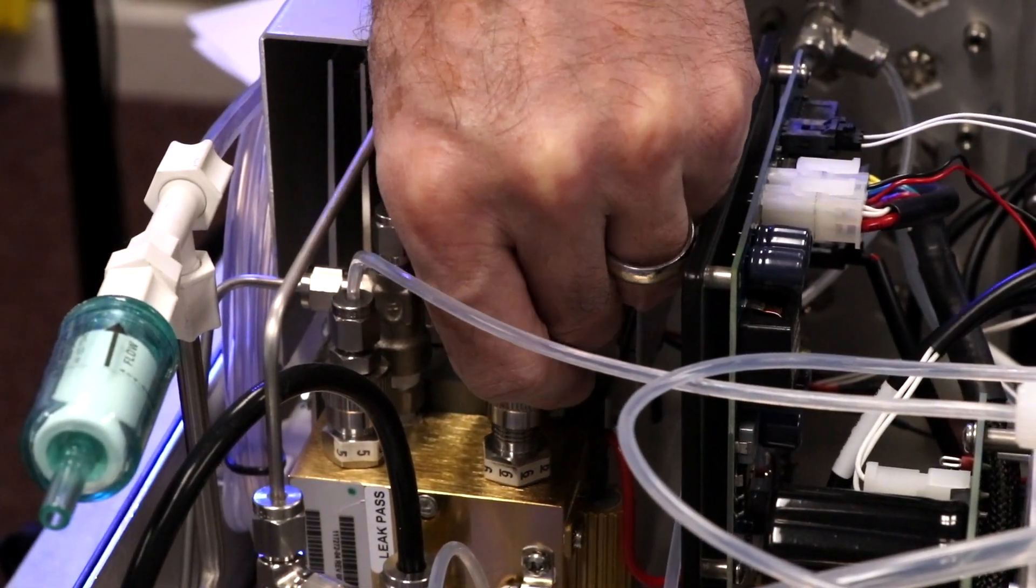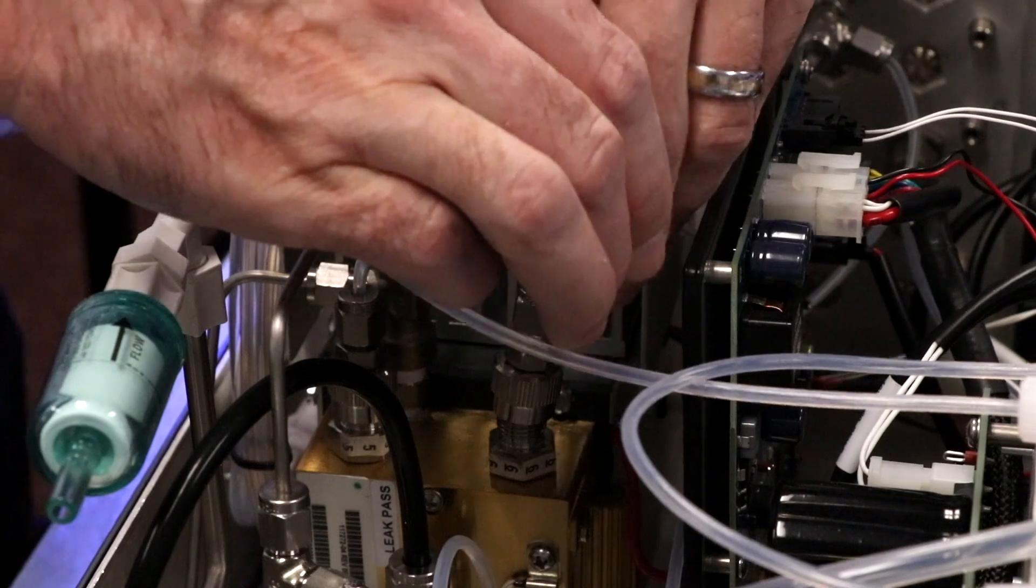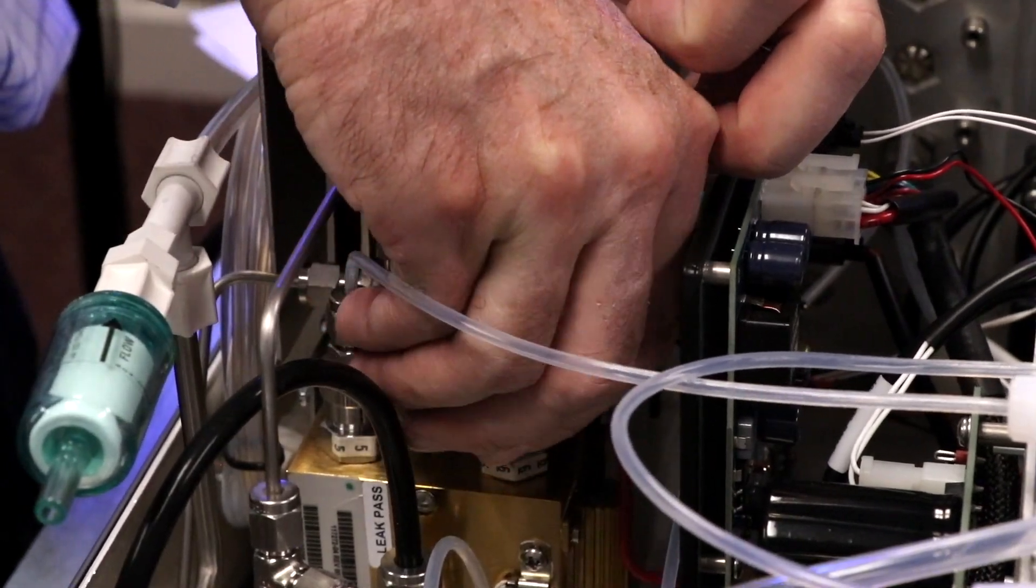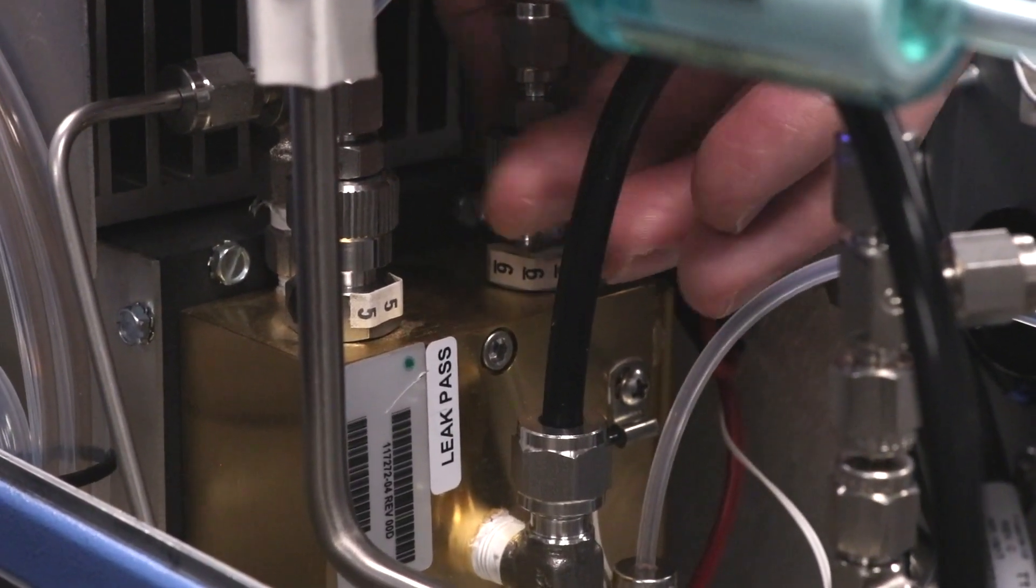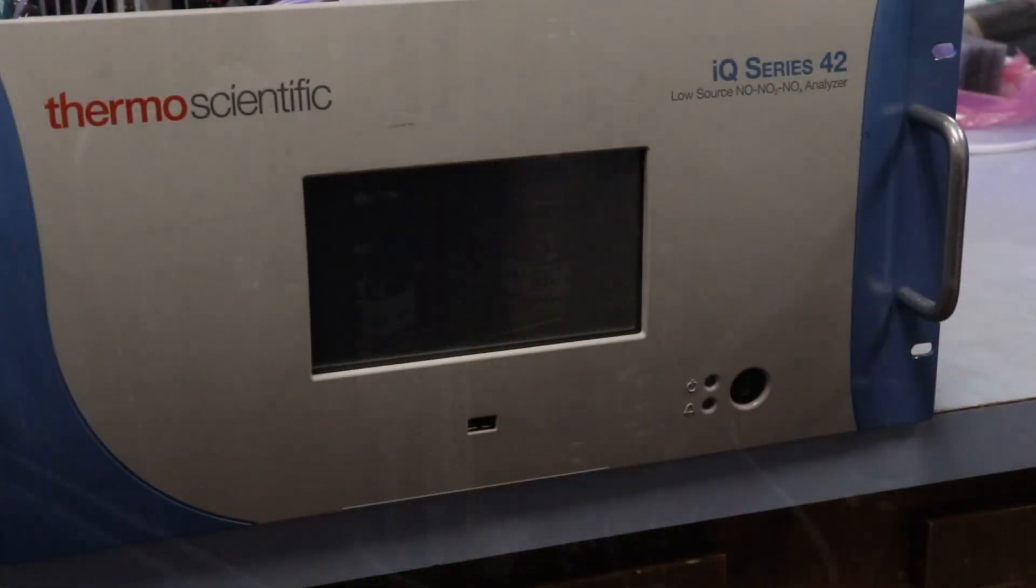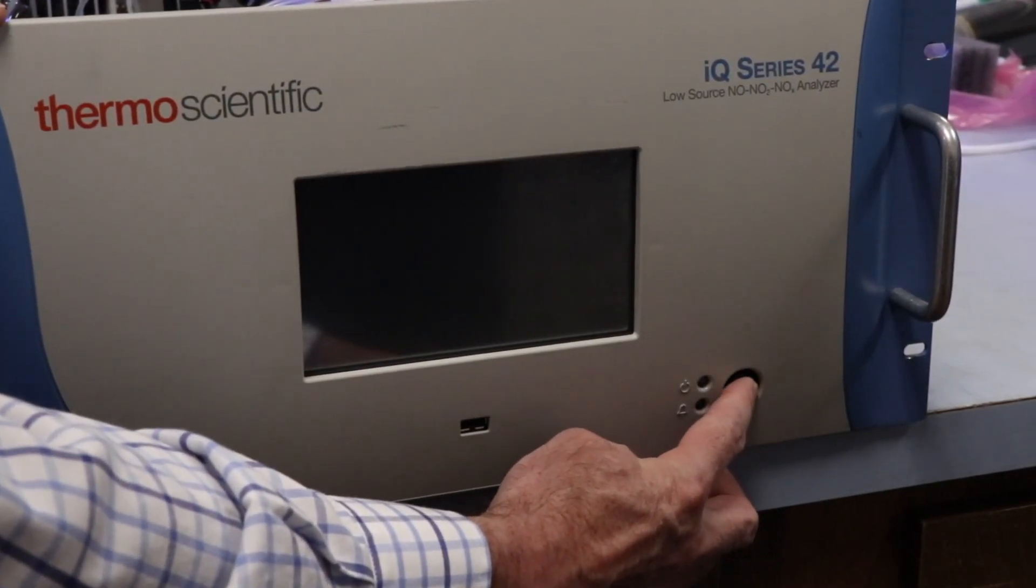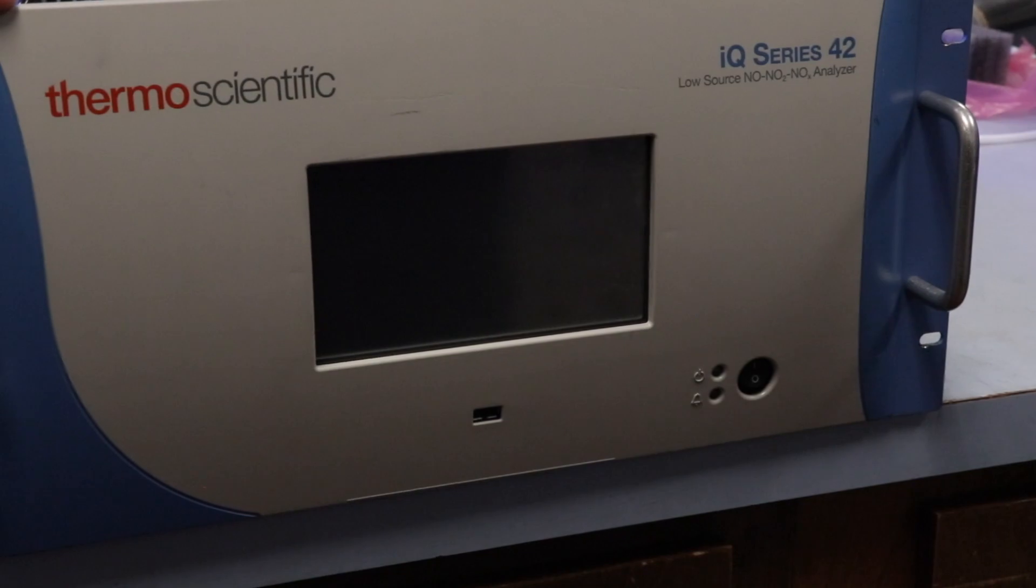Reconnect the tubing to the top of the fitting, being careful to insert the ferrule and O-ring properly, and tighten the knurled nut finger tight. You can now reinstall the cover, connect to power, and turn on the instrument.